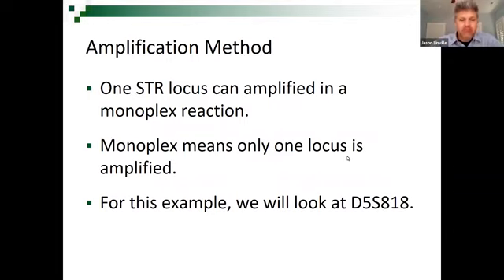So this leads into the lab that we're going to observe next week, or would have observed, or I don't exactly know how to phrase that. But what I want you to do is sort of visualize that we're setting up an amplification reaction. We know that there's 4 things that go into the tube, but we want to start visualizing, if we're amplifying STRs, what exactly is on the bench in front of me? And what exactly am I squirting into the tube?